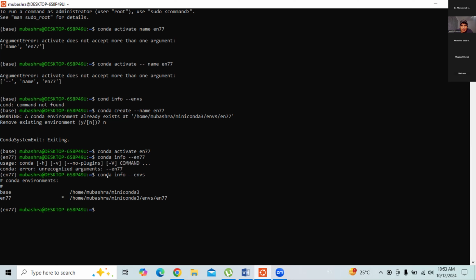So what is the next step? You need to install FastQC. What is the command for it? Let me type it again in the chat. Here it is.